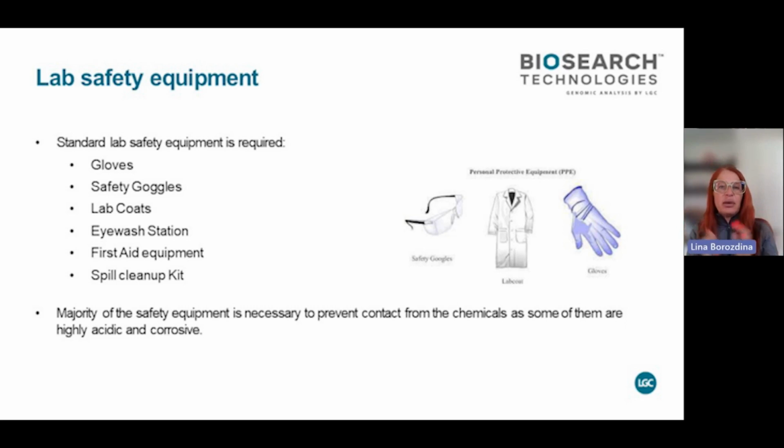So lab safety equipment, this is not something I need to tell you about. If you ever worked in a lab, you know all about personal protective equipment. Make sure that you always wear goggles when you work with the synthesis reagents. It's not very much fun to get acetonitrile in your eyes. It burns. Other ones, I'm not going to even go there.